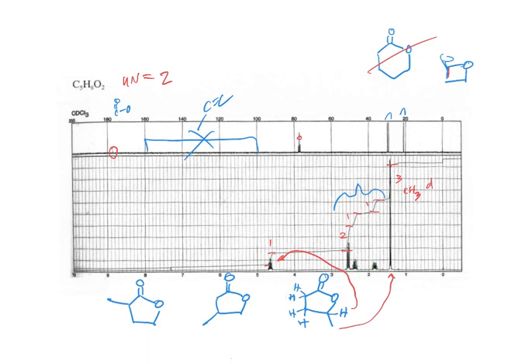Oh, these two? No, it's not, because those ones can't rotate. I know, but the chirality of that is what would split it into a doublet. So you'd have a triplet, a doublet. The most upfield should be the ones that are farthest away from any of the functional groups, which is probably these two. These two are next to the carbonyl, so they're probably here, right?